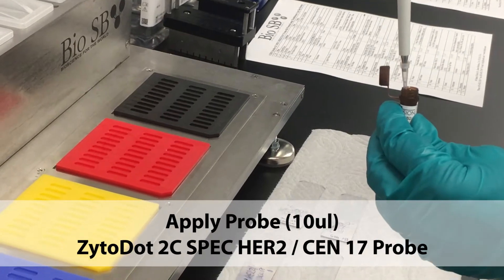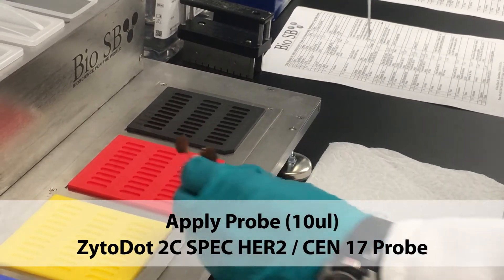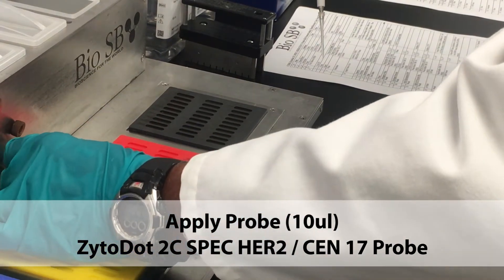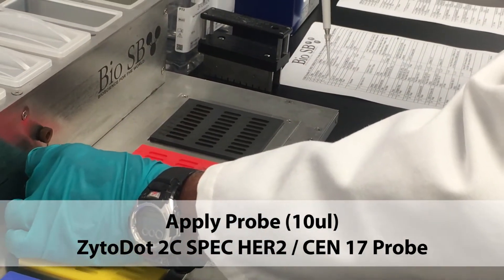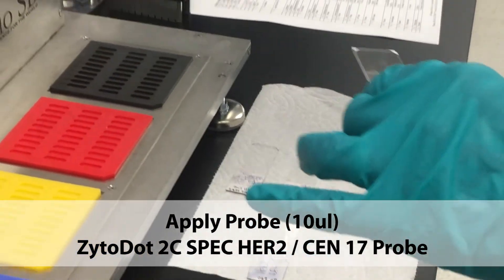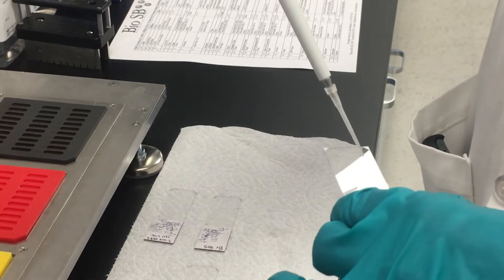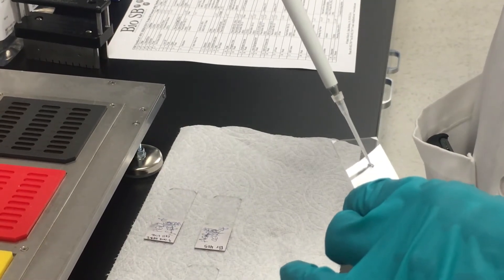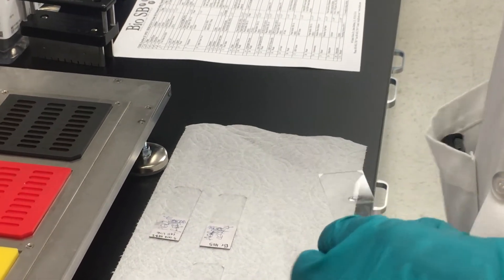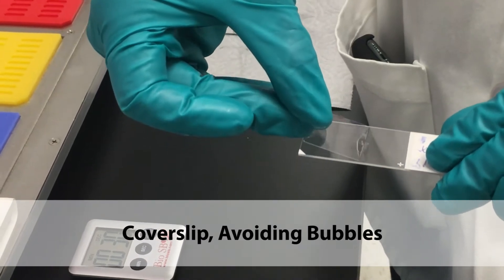Apply the probe to the slides. Cover slip, being sure to avoid air bubbles.